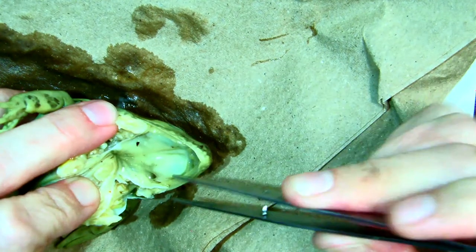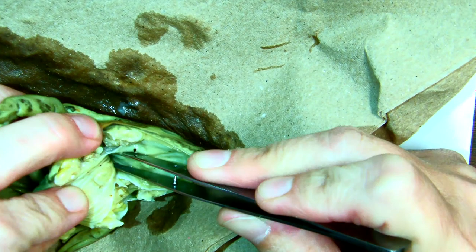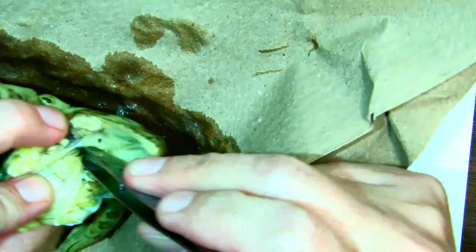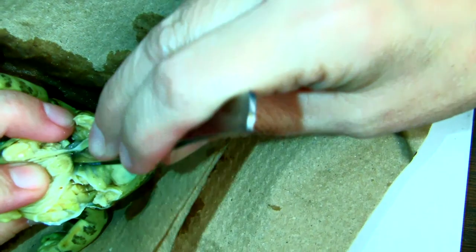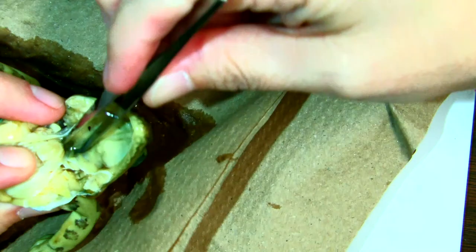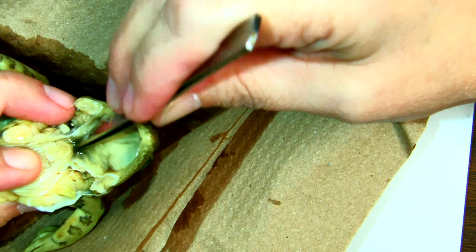Then we have the gullet. So once he does swallow his prey, it goes down the gullet, and this leads to his stomach. That's the gullet, which would be our esophagus.